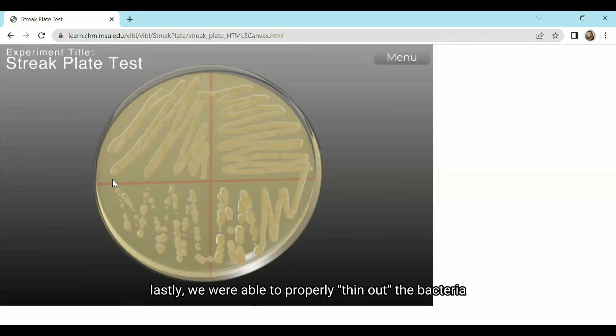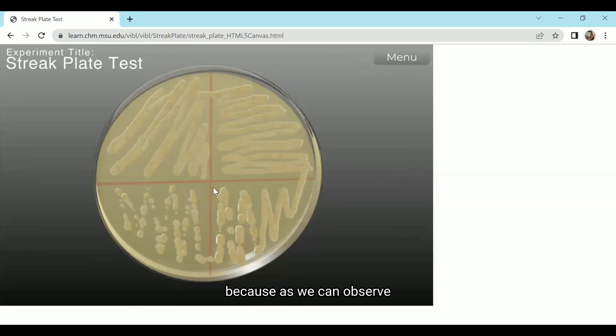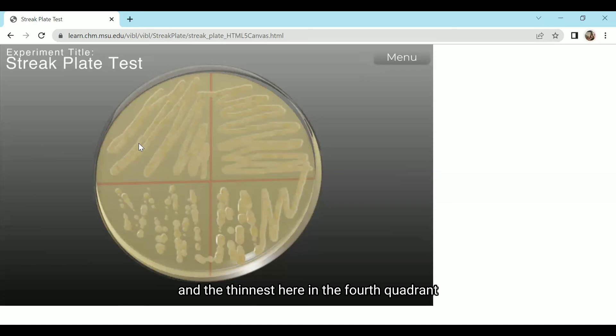Lastly, we were able to properly thin out the bacteria because, as we can observe, the bacteria was the thickest in the first quadrant and the thinnest here in the fourth quadrant.